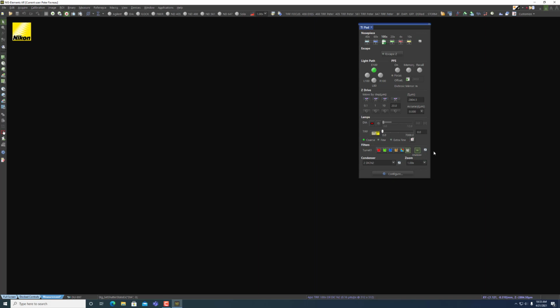And these are our set of filter cubes that are in place here. If you hover over any one of these, they'll give you a little description of what this filter cube is. A filter cube just contains the excitation filter, the emission filter, and the beam splitter for generally a specific area of light that we want to isolate and look at. So they're usually very specific to fluorophores. This one's very specific to DsRed, TRITC, Cy3. This one is, of course, very specific to GFP, DAPI, and this is quad.